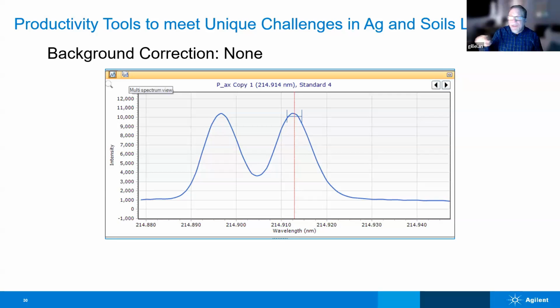The tail of that peak, especially if there was more of whatever that is in there, would certainly cross over the axis of the phosphorus line, where that red line is, and cause problems. It would give you a false positive signal for phosphorus, especially if none were there otherwise. So something needs to be done.